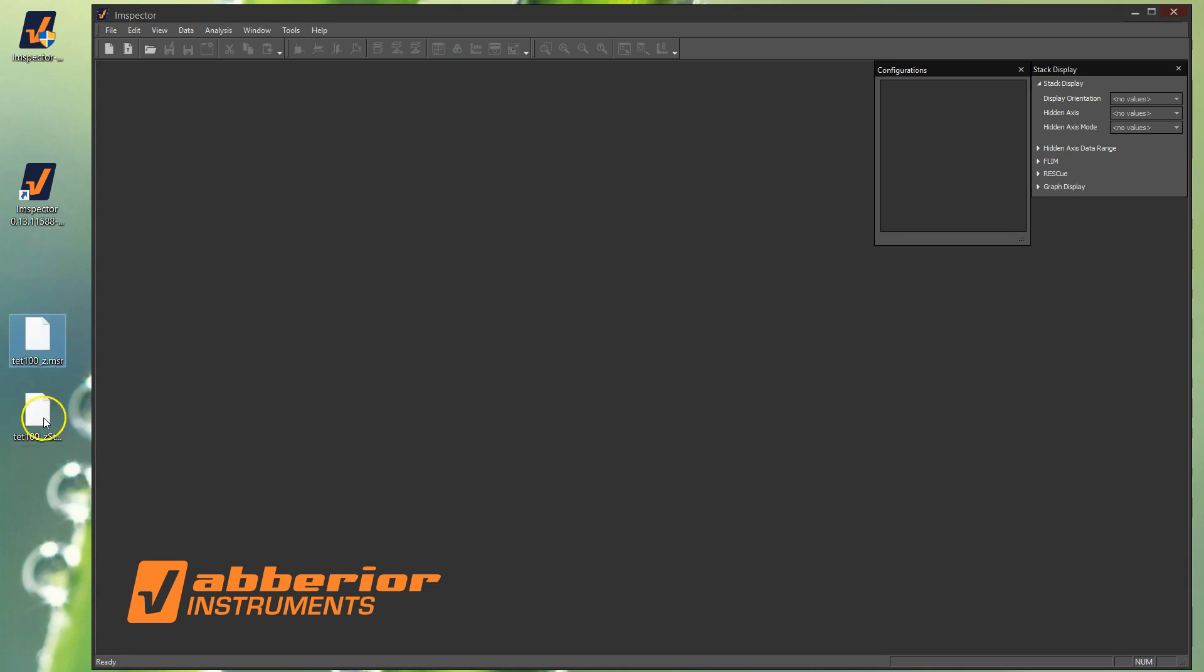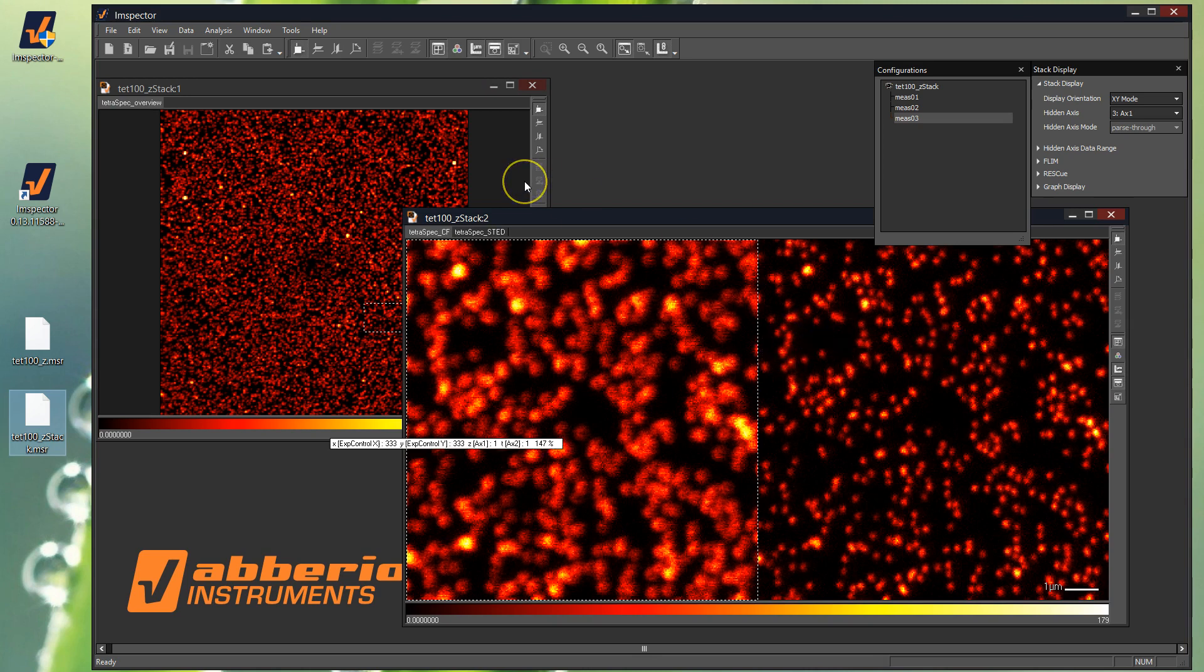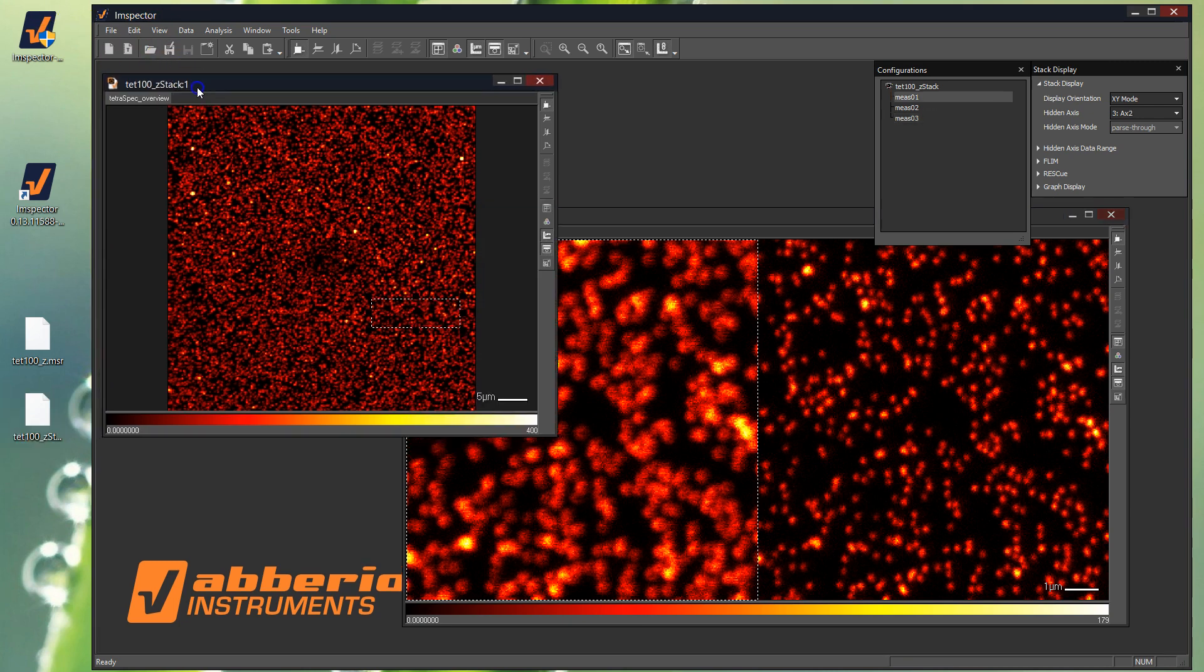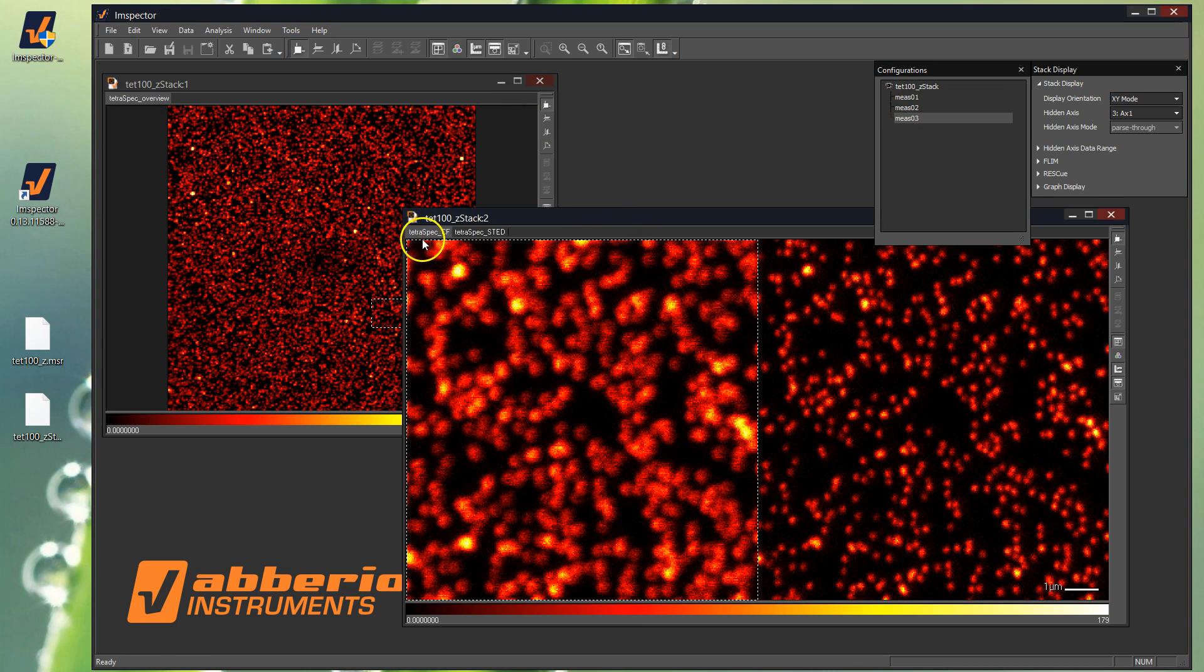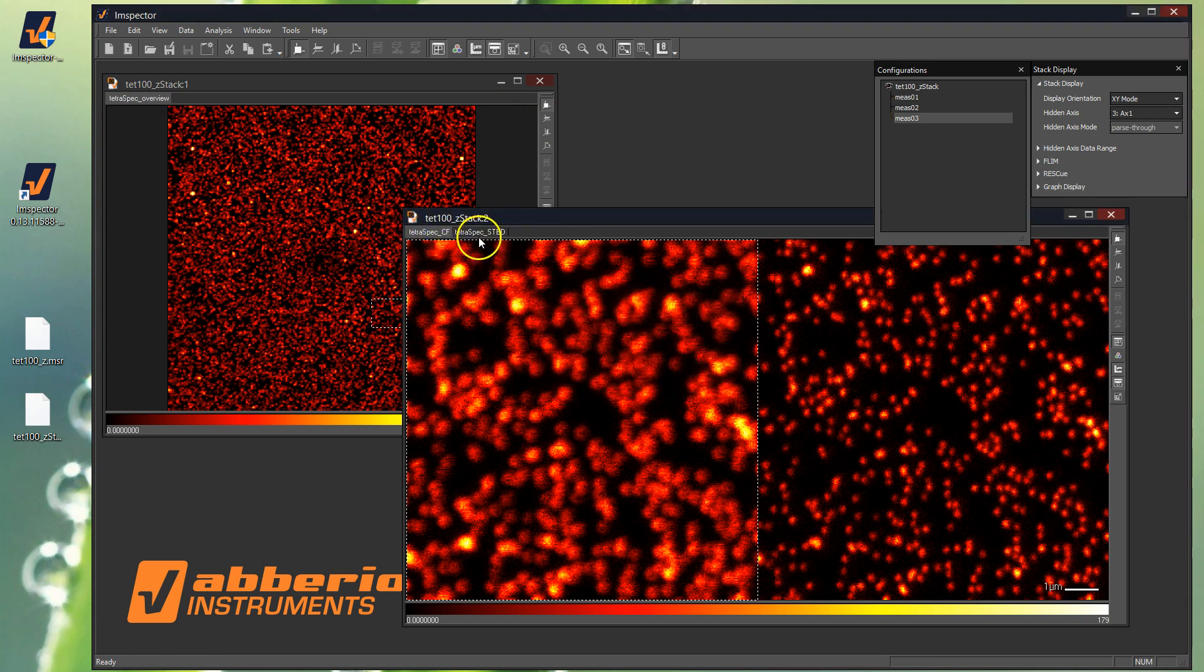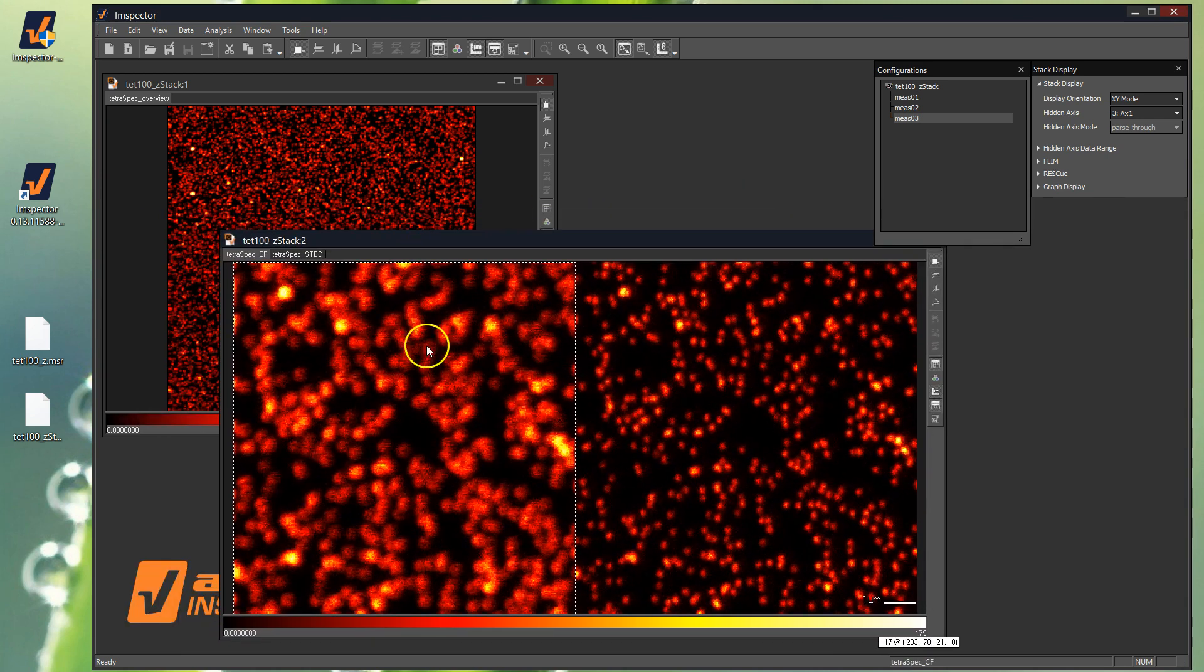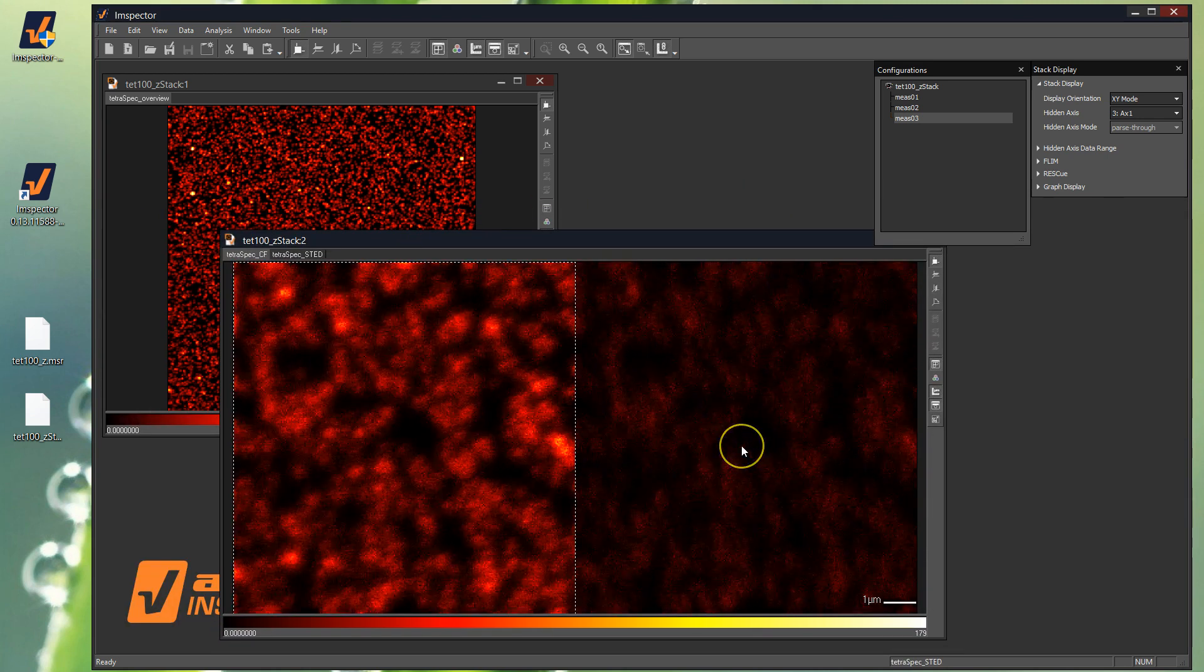So I've got a Z-stack. This is the one I used from the Fiji YouTube, but I've done some changes on this one. So let's drag and drop this one in and it shows you kind of an overview you saw while you were collecting the dataset. And I've renamed the files. The one I originally had, I didn't name them properly, but you can double-click and rename them to something more useful.